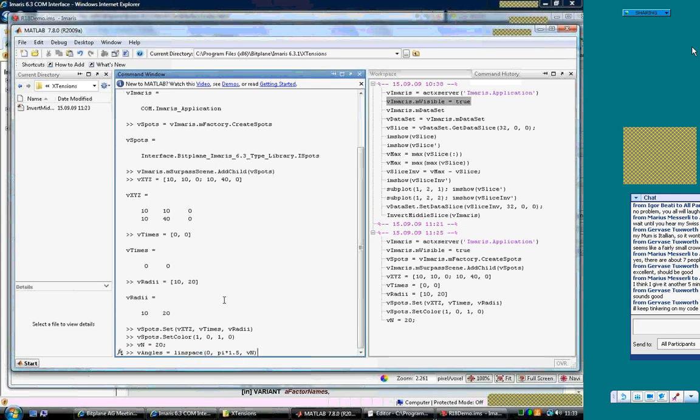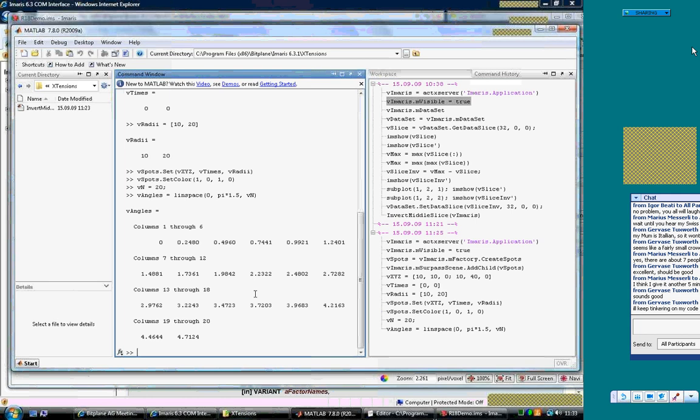Look at them here, and it's all there. Now, if you know the formula of the circle, we have to use the cosine on the x dimension and the sine on the y.